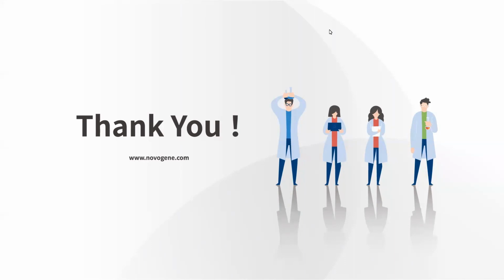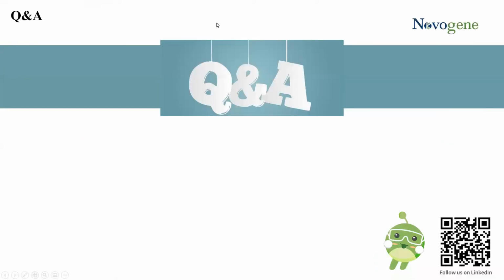So with that, I'd like to hand it back over to Dr. Isidoro if you can answer a few of the questions that are coming in. Hello, thank you, CB. There are a couple of questions here that are still open and I'd like to touch on. One is, what does Q2 mean? I think the question the client was trying to ask is, what are Q20 and Q30?